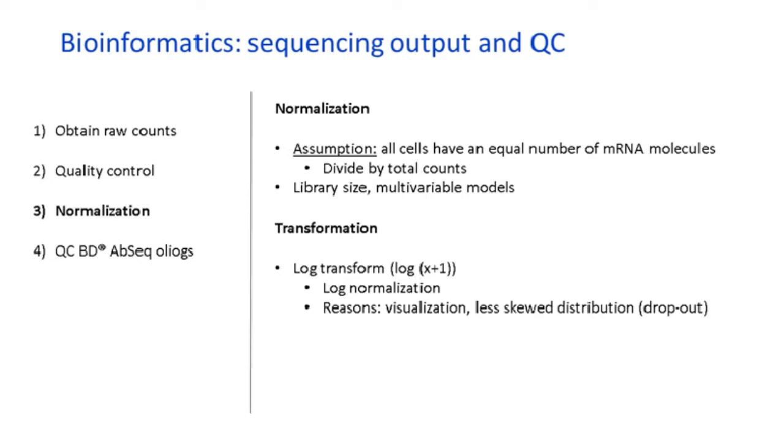This is very common in blood samples from cryopreserved tissue or blood, like in this case, because, of course, cells are stored at different times from different patients, from different time points, and the analysis is performed on different days. Therefore, it would be crucial to consider all those variables to make an appropriate analysis.